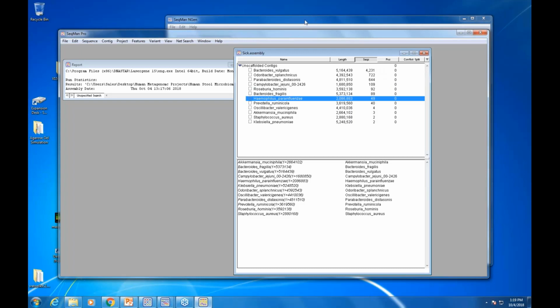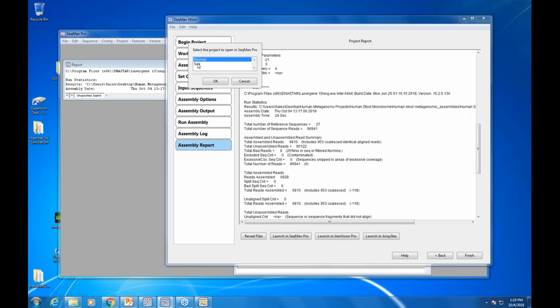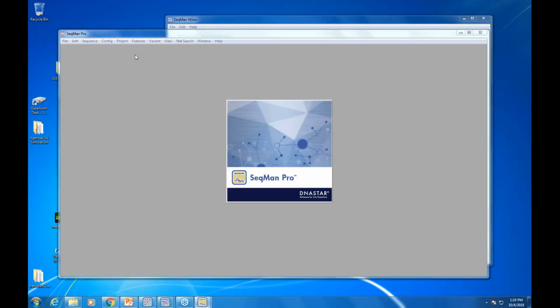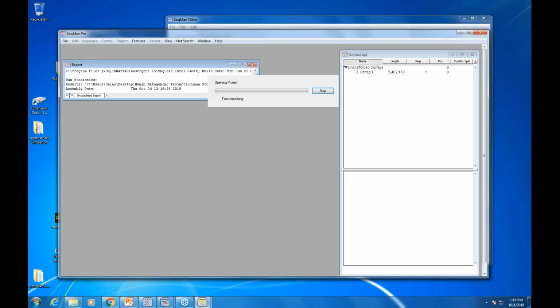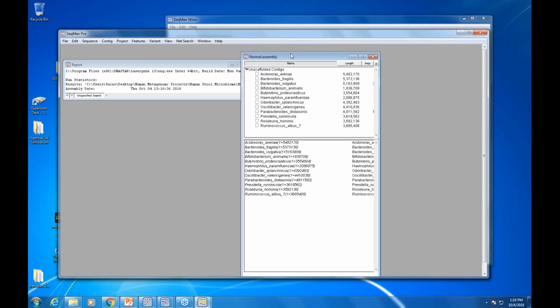And so I could do the same, go back here. And of course, on a little sample like this, I can just eyeball it quick and see what's going on. And I often recommend that, even if you have a large data set, to run a little pilot, run 1% of the data or 10% of the data to see what's there. Sometimes, if you align to a full database, you'll see a lot of human contamination. And so you might want to do a screen.